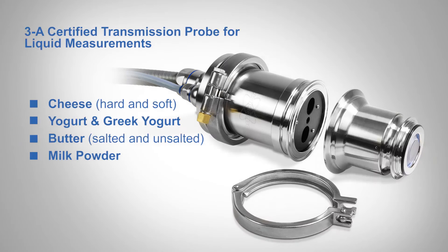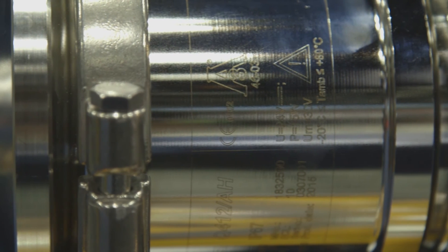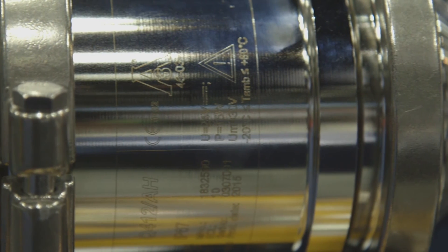If you're looking for state-of-the-art accuracy and precision in your measurement system, a probe that is 3A Certified to meet sanitary design guidelines, and a probe that is the gold standard in robustness, then the Bruker Q412 3A Certified Reflectance Probe is the solution for you and your manufacturing plant.